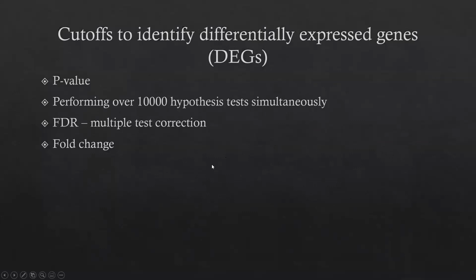Another cutoff people may think about is the fold change of gene expression. And sometimes if you think the gene should undergo a very significant change in terms of gene expression difference, then we may select a reasonable fold change cutoff.